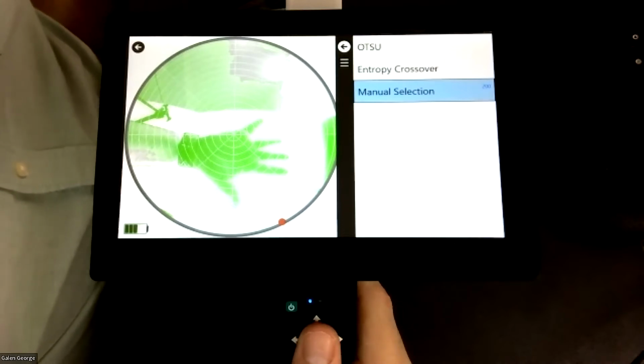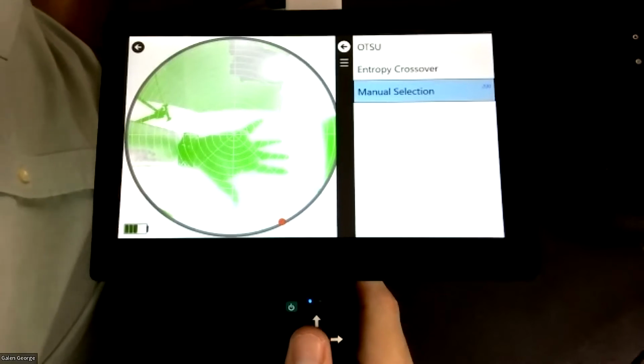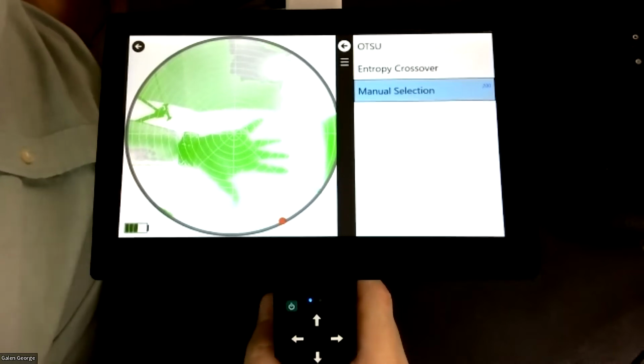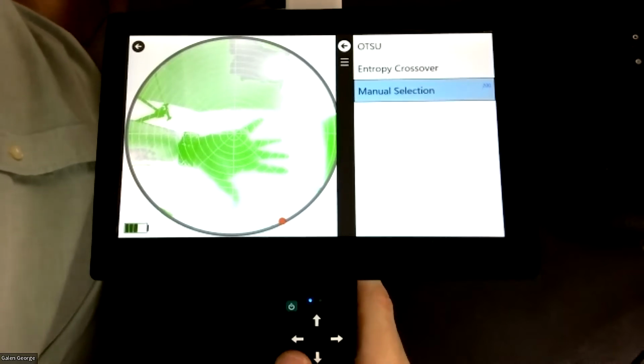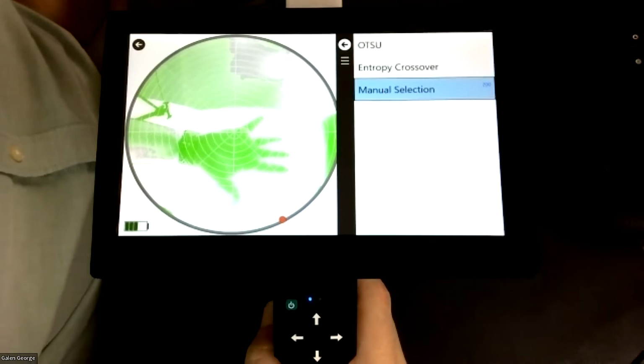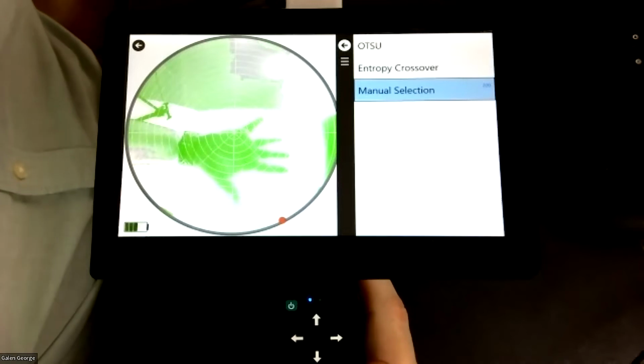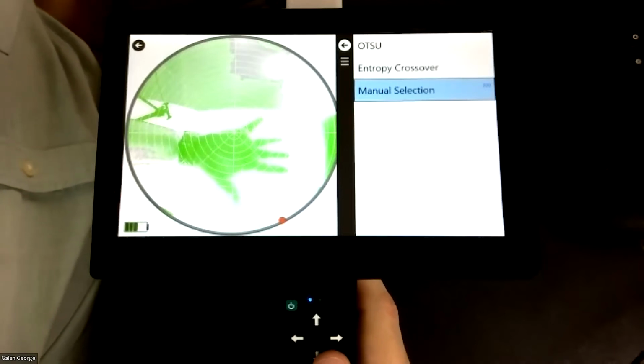If you want those to be identified as sky and not plant, you can take that image and do some trial and error work to figure out what threshold you need to set in order to make sure that it's consistently only identifying what you want it to identify as plant.